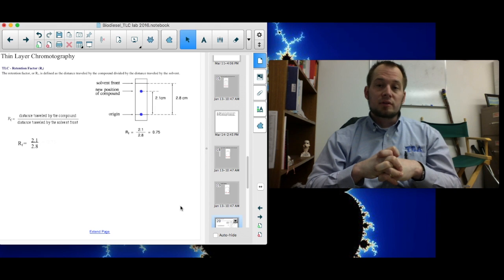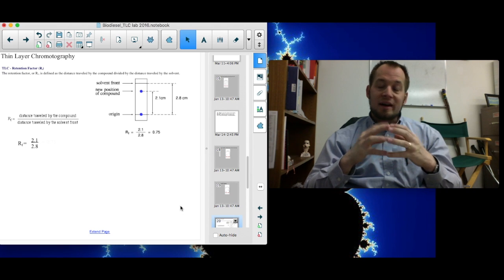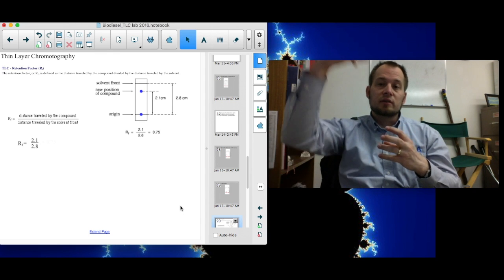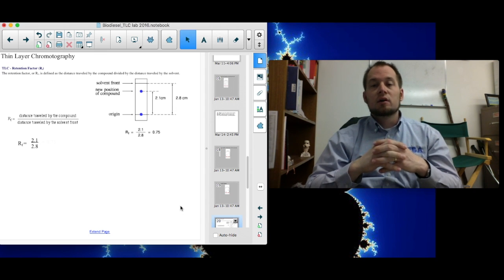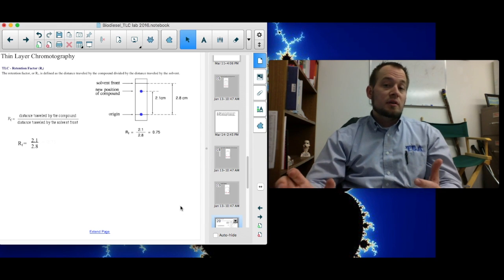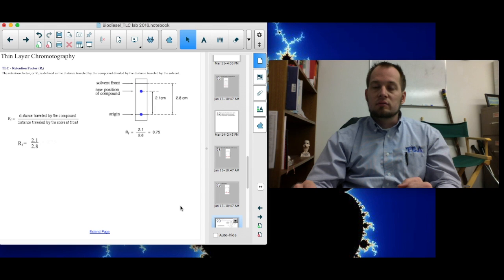In our case, our biodiesel did well. It did what we thought it would do, and the biodiesel would be interacting or attracted more strongly to the solvent because it traveled further. It was more attracted to that solvent, so it traveled with it. Our oil was less attractive. All right, that should be most of what you need for the TLC, and hopefully this review was helpful for you.